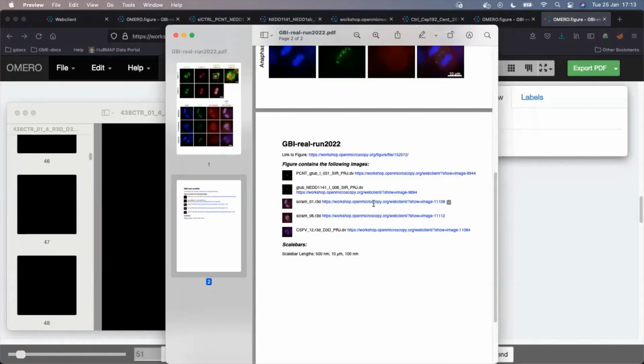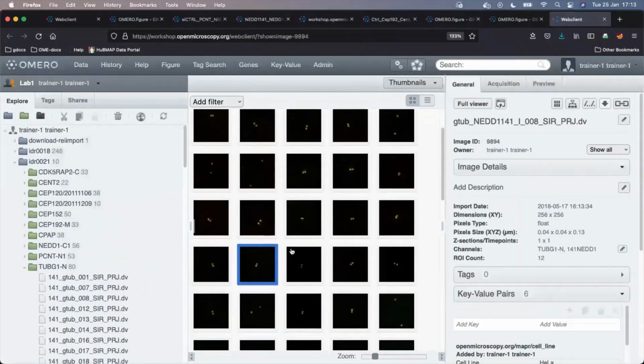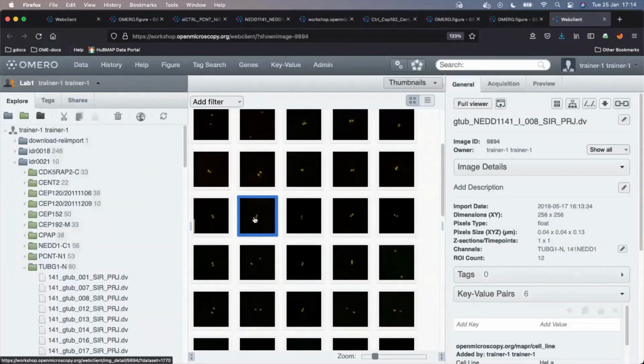If the feedback comes back saying change the panel 3A, you were wondering what is the underlying raw data of panel 3A, and if you create yourself a PDF like so, this is the underlying image. It's right here, and you can go again very easily and correct any mistakes which were picked up by the reviewer, reusing this image underlying the panel 3A.